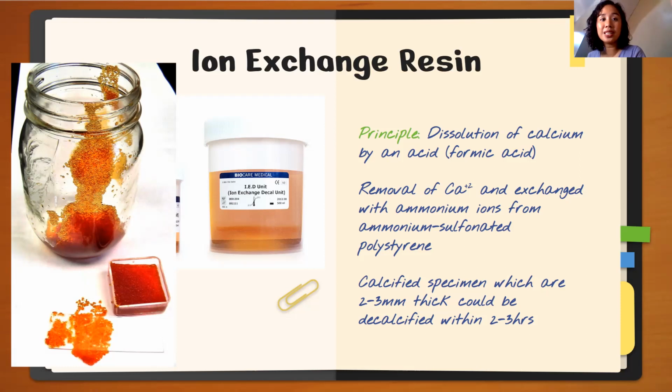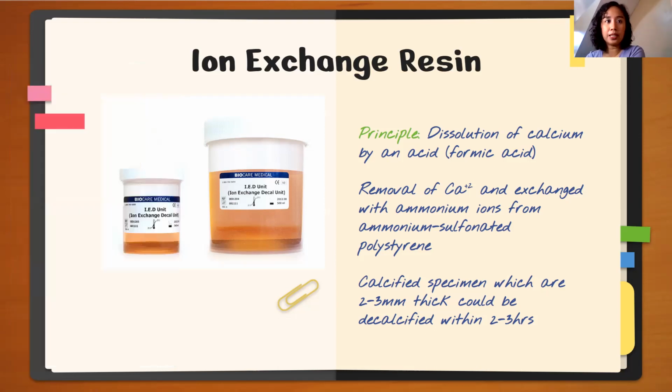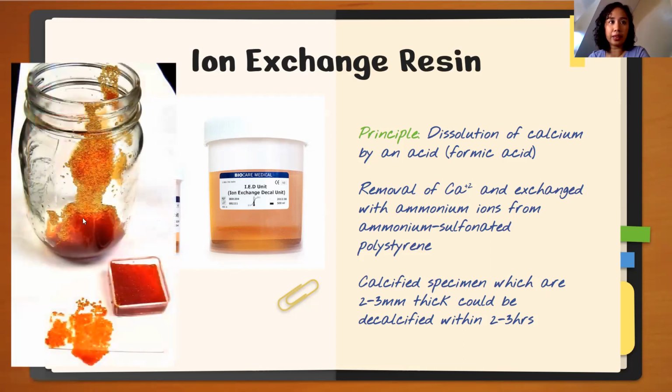So that's the good news. It doesn't have to be 24 hours to 48 hours. If it's only 2 to 3 millimeter thick, yung maninipis lang talaga, hindi yung mga femur, it could only last for 2 to 3 hours. Yan, that's the good news with ion exchange resin. And you could reuse this one. Yan siya. Okay? So, ayun yung parang mga resins. Ammonium sulfonated polystyrene. Yan. So, it's like this.